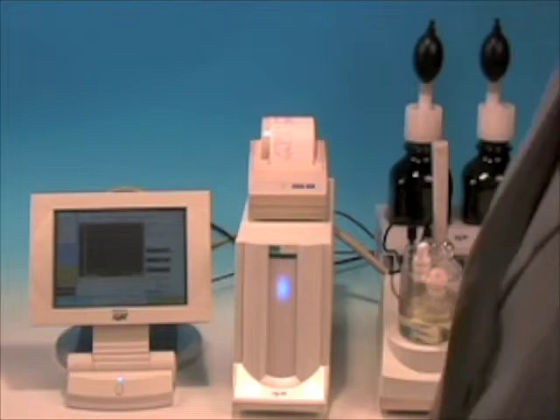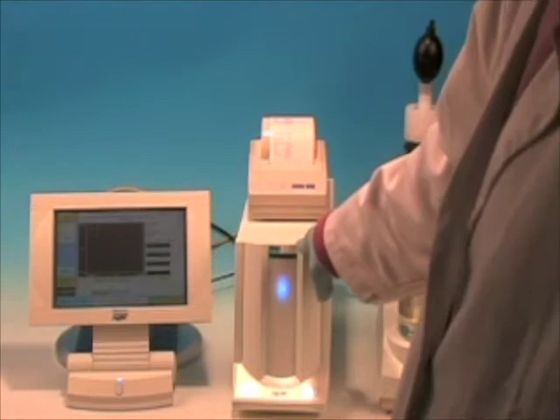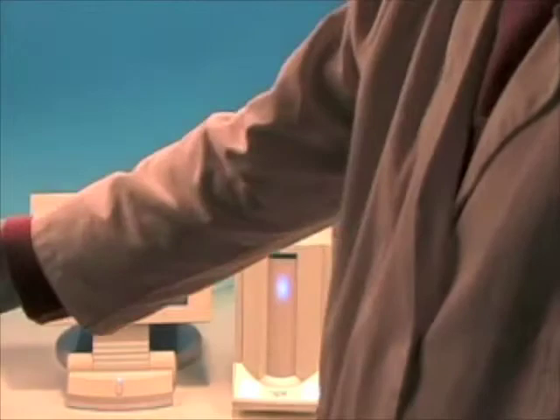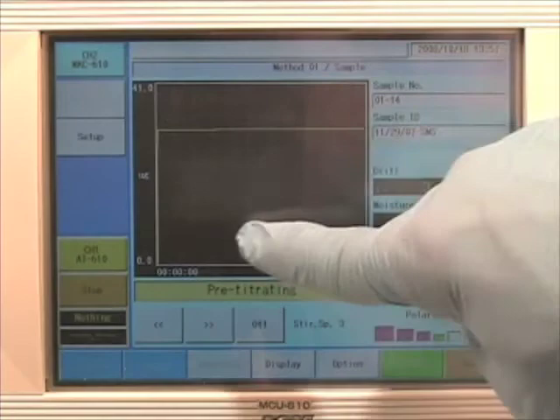It's the 600 series and what's unique about the 600 series is that it uses an 8-inch flat panel touch screen and you're able to actually toggle between two titrators at one time. We only have one titrator connected with this master control unit, but you could have an identical system on the other side and be able to simultaneously run two titrators and manage them from one screen.